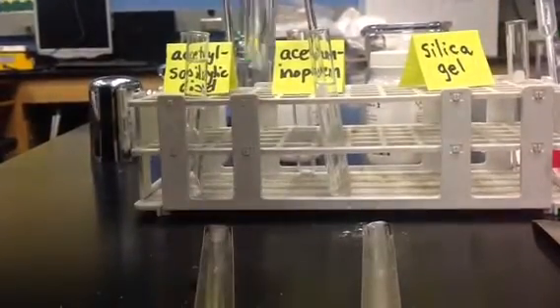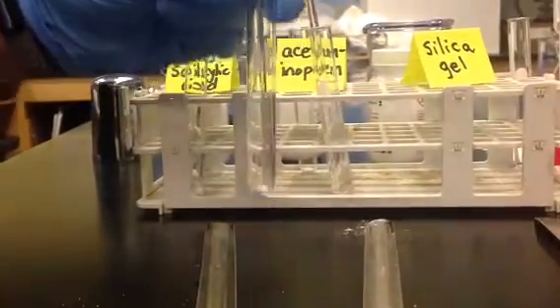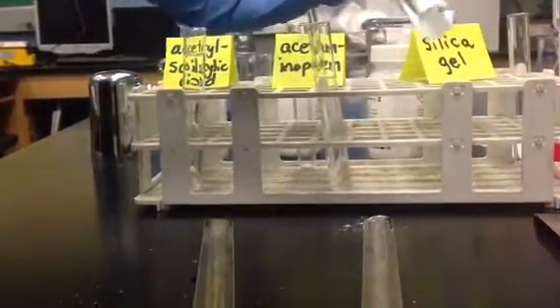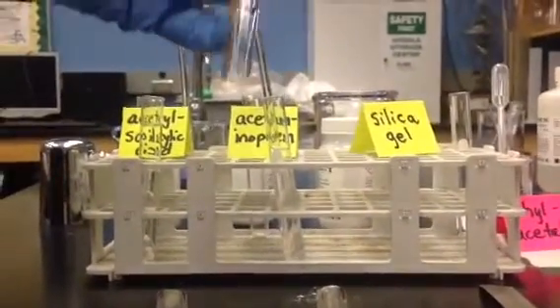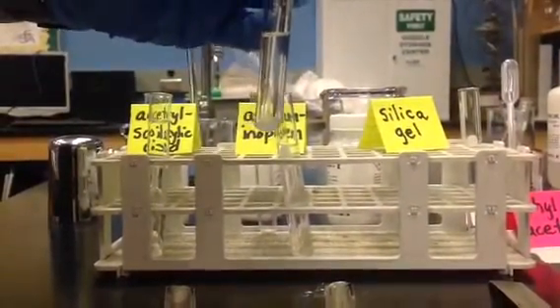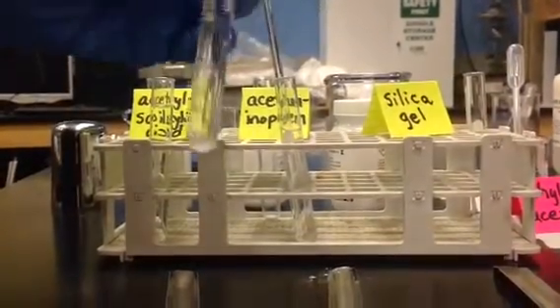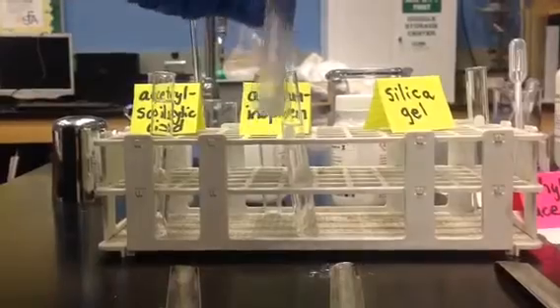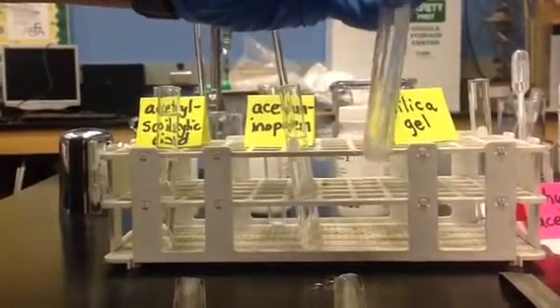And I don't think I really need to add water to the silica gel, but we just want to confirm that, okay, the silica gel was not dissolved by the ethyl acetate. So will water dissolve it? So we've got to try and mix it up again.